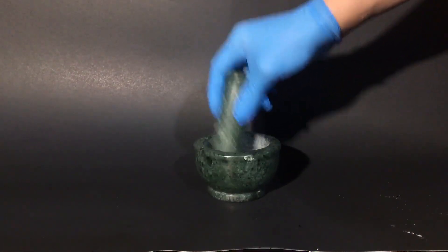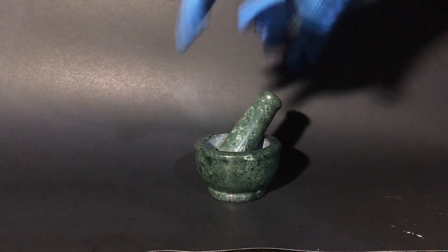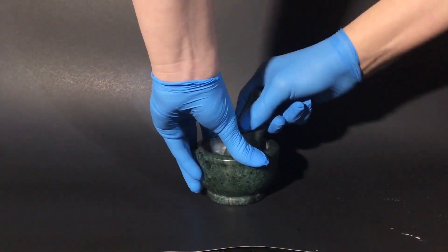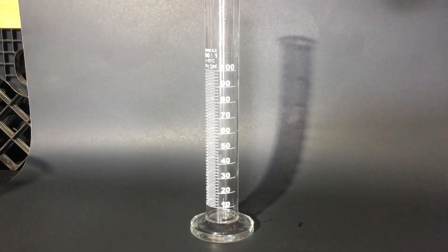Sodium permanganate is the inorganic compound with the formula NaMnO4. It's closely related to the more commonly encountered potassium permanganate, but it's less desirable because it's more expensive to produce.